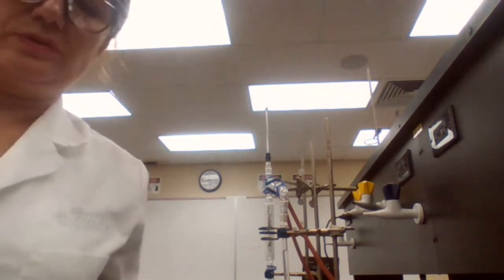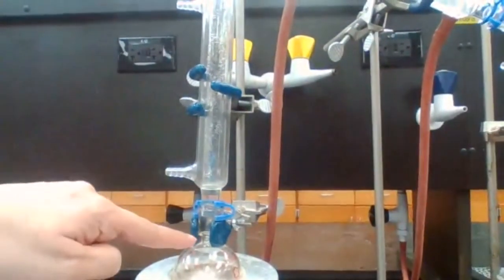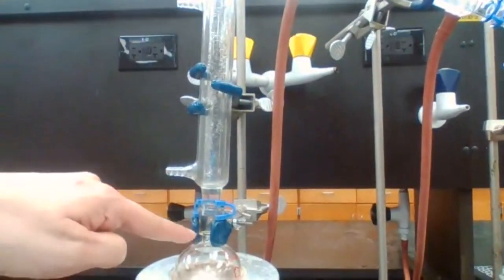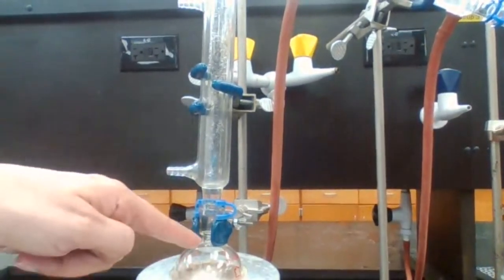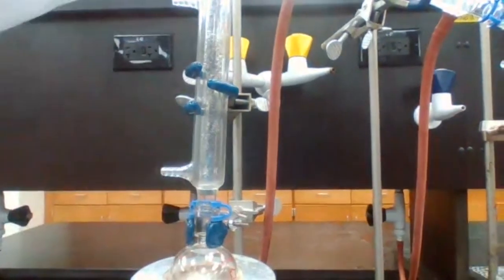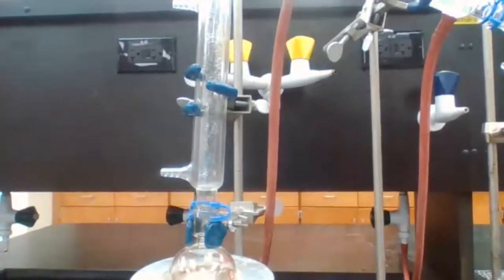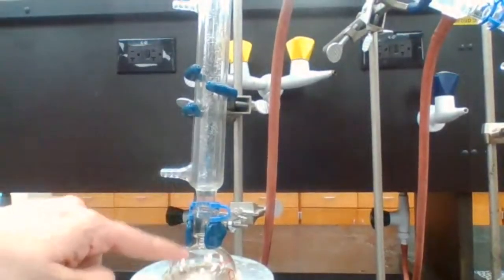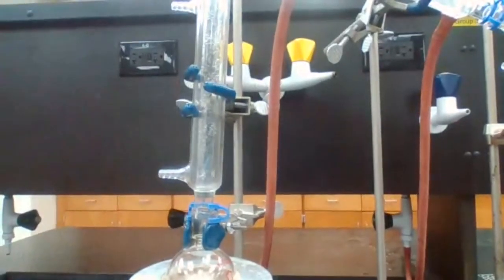And I want to show you how this fractionating column is actually returning the compound B. See this distillation? For simple distillation, you don't see that return. You don't have that return going back to the flask. When it vaporizes, it goes to the distillation head and directly to the condenser. But for fractional distillation, compound B is the one that is being pushed back.